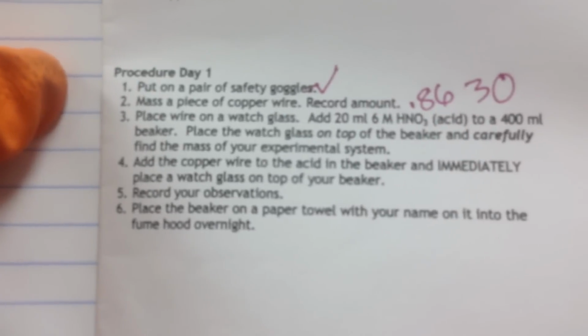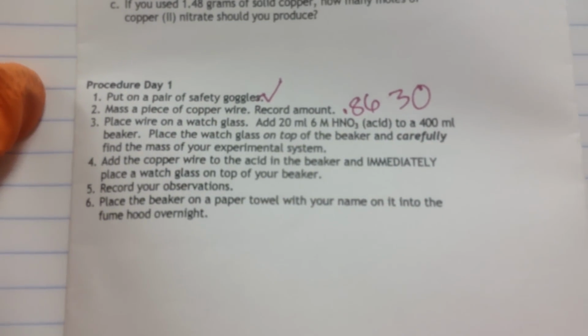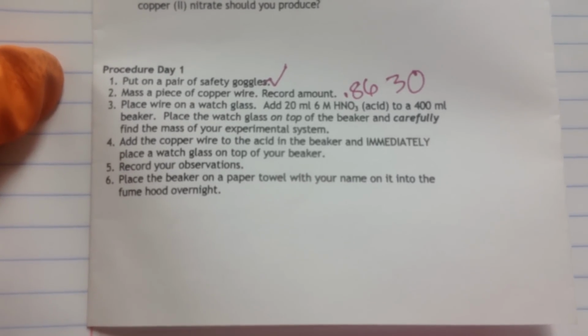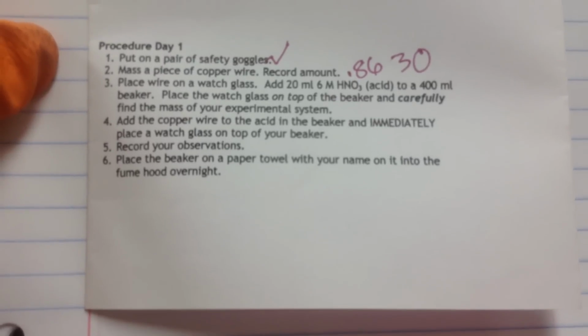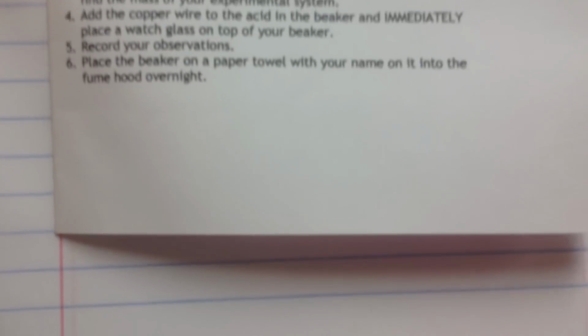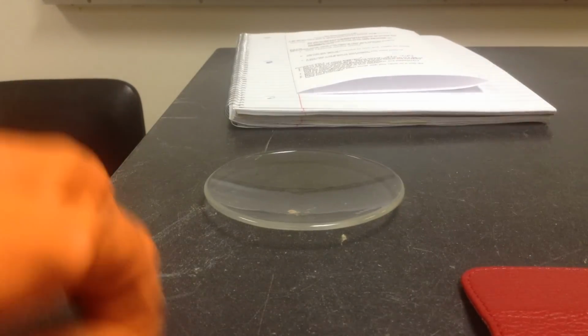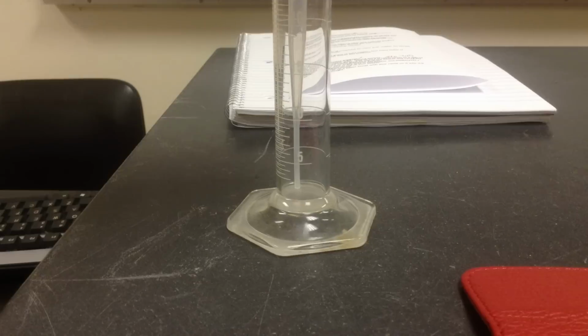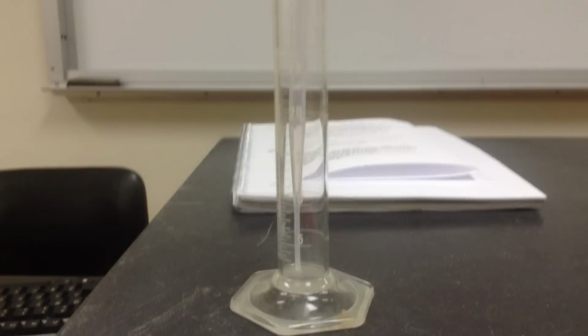The next step is to place the wire on a watch glass, add 20 milliliters of the 6 molar acid, which is very concentrated, one of the reasons we're doing this as a demo, to a 400 milliliter beaker. Then we're going to place the watch glass on top of the beaker and carefully find the mass of the whole system. So place the wire on a watch glass. And we're going to measure out 20 milliliters of our very concentrated nitric acid.